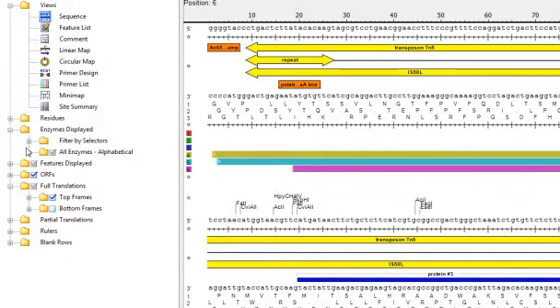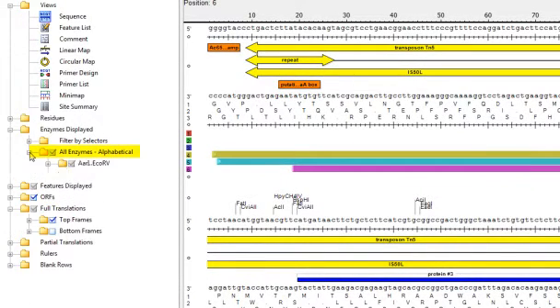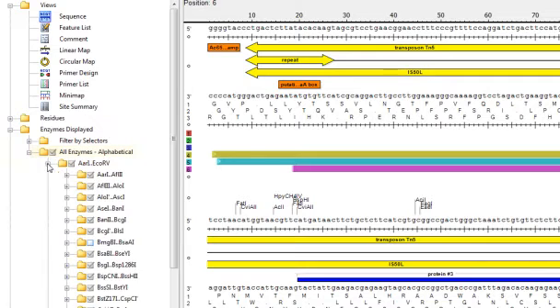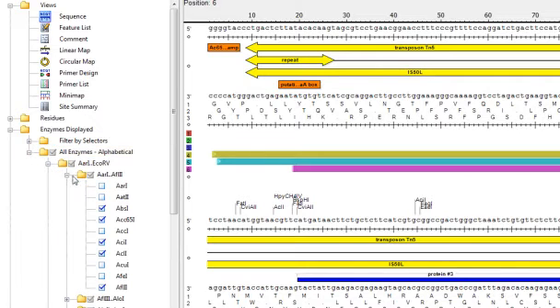You can also display enzymes by drilling down through this alphabetical list and simply selecting them individually.